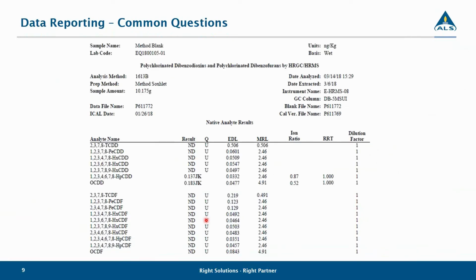Now I'll talk about common questions regarding the data. Here's an excerpt from a report for a method blank associated with a PE sample.